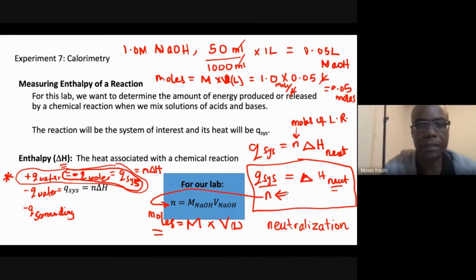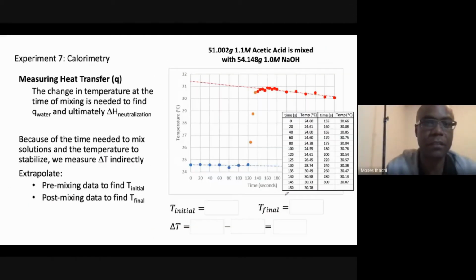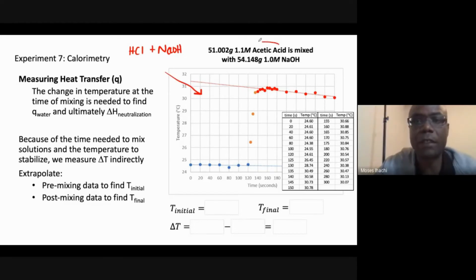Okay, that means everyone is happy. We move on. For the reaction with HCl and sodium hydroxide, you're going to need to plot a graph in your report. For the one with acetic acid, we're going to need to use the simulation. That's how I'm doing it for my sections. So we'll plot a graph, and for the acetic acid, we'll try to get a taste of what you should have done in the lab, or kind of pretend it's hands-on.